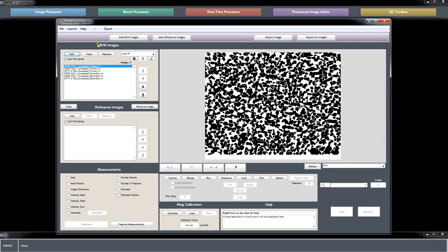So I think we've, Matt, you had asked for the batch processing of different images. Let me check if you are. Okay. Was there a particular case that was struggling? Okay. Thank you. Good to know.